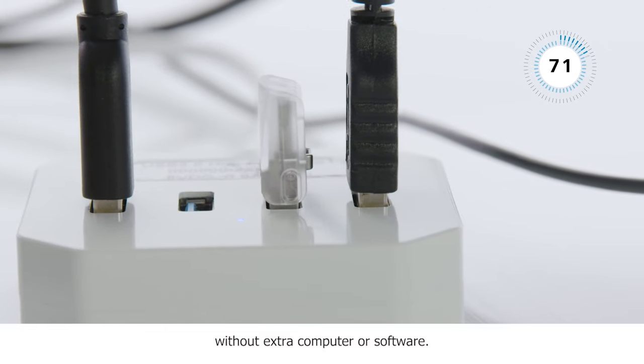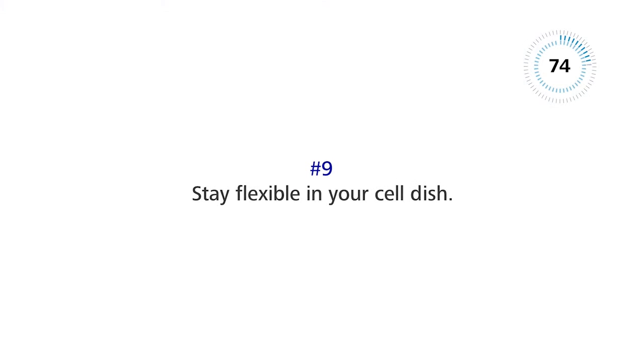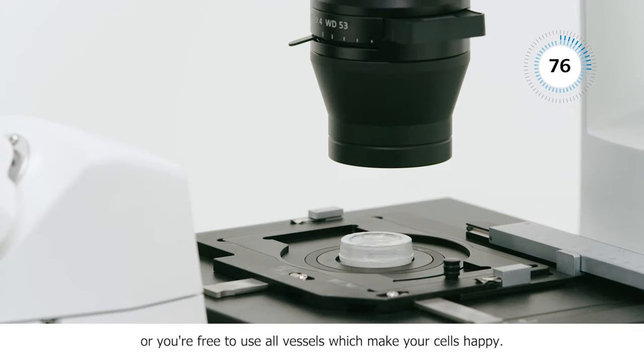With a range of stage inserts and available spacer, you're free to use all vessels which make your cells happy.